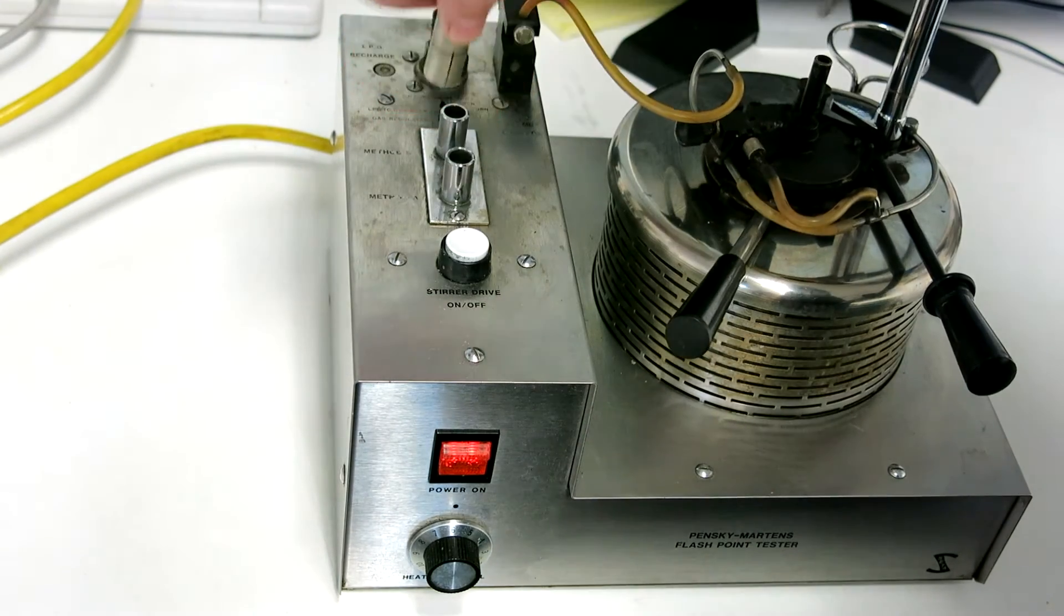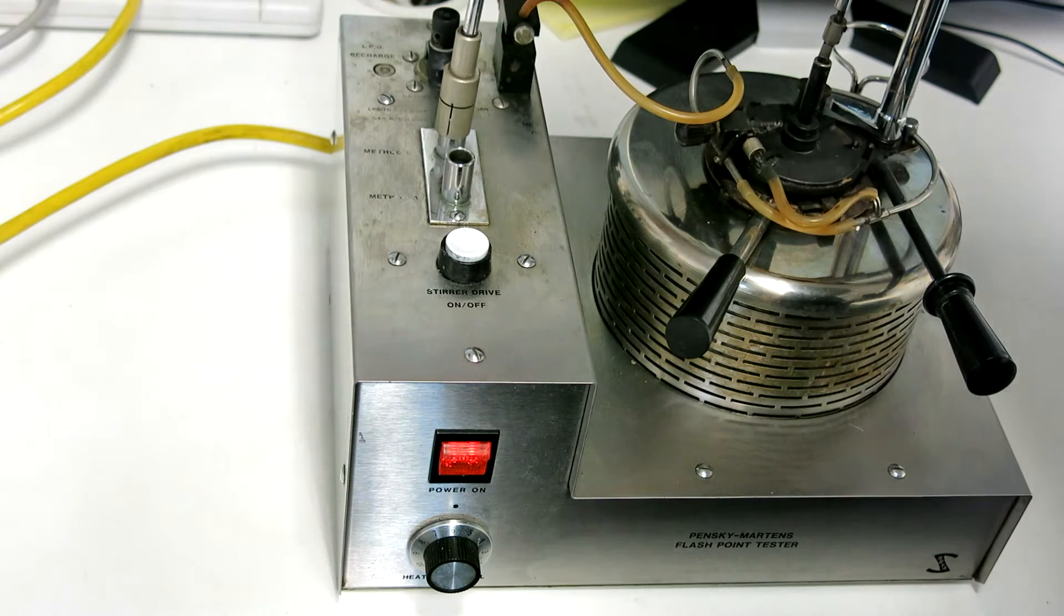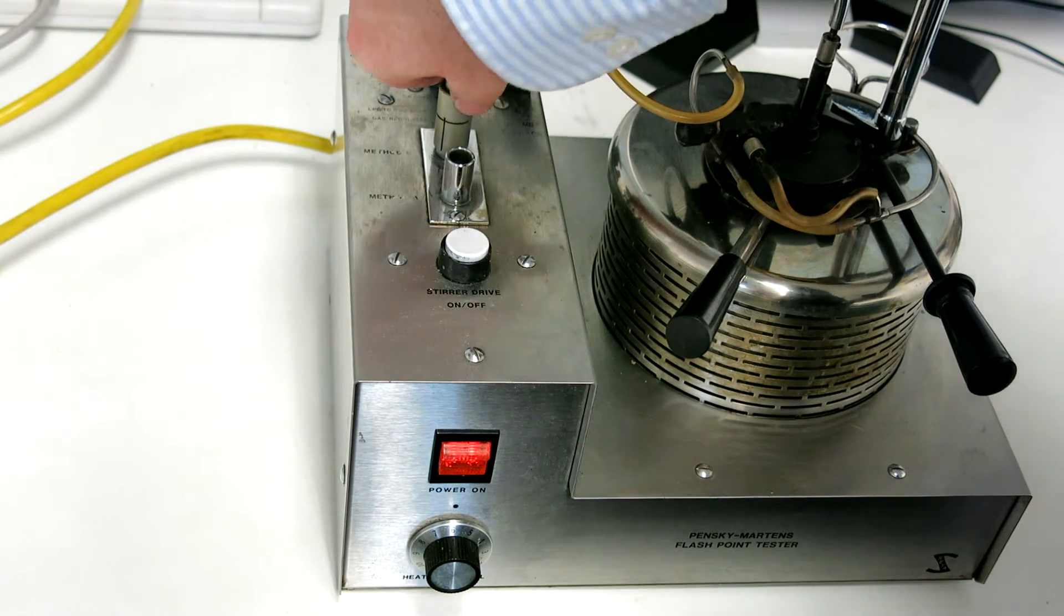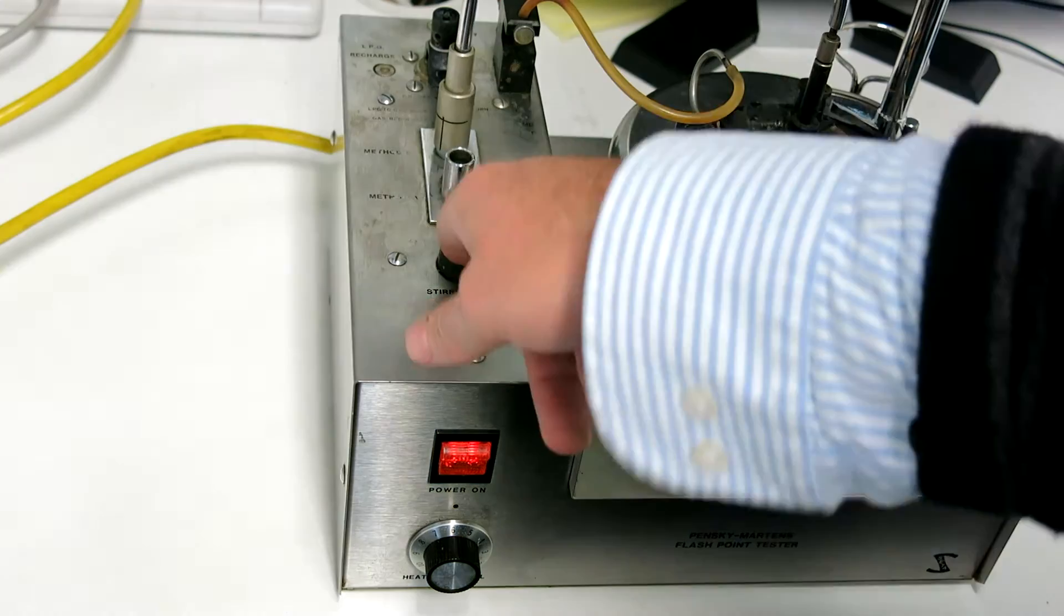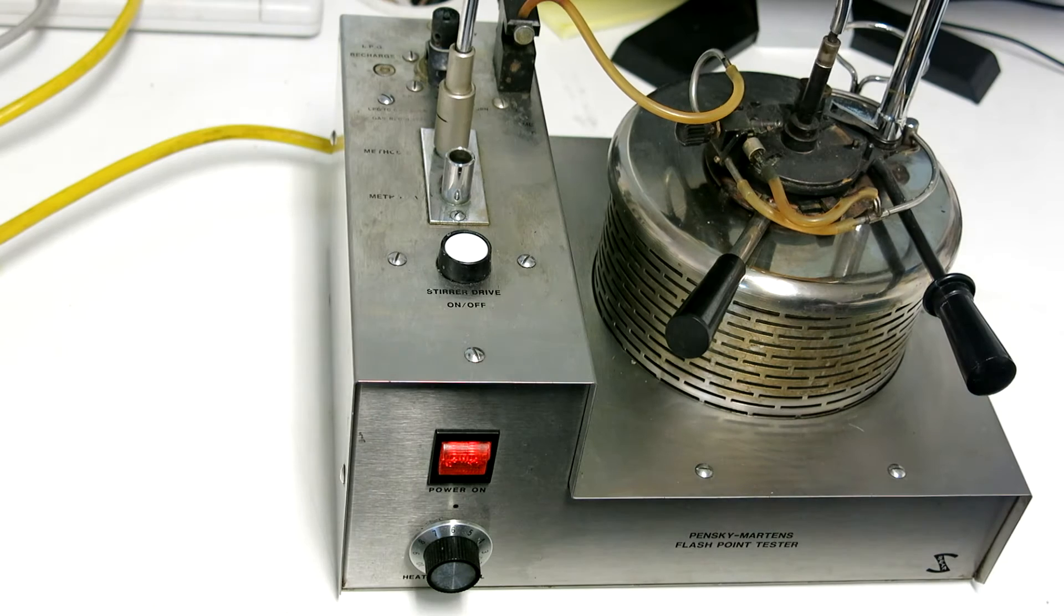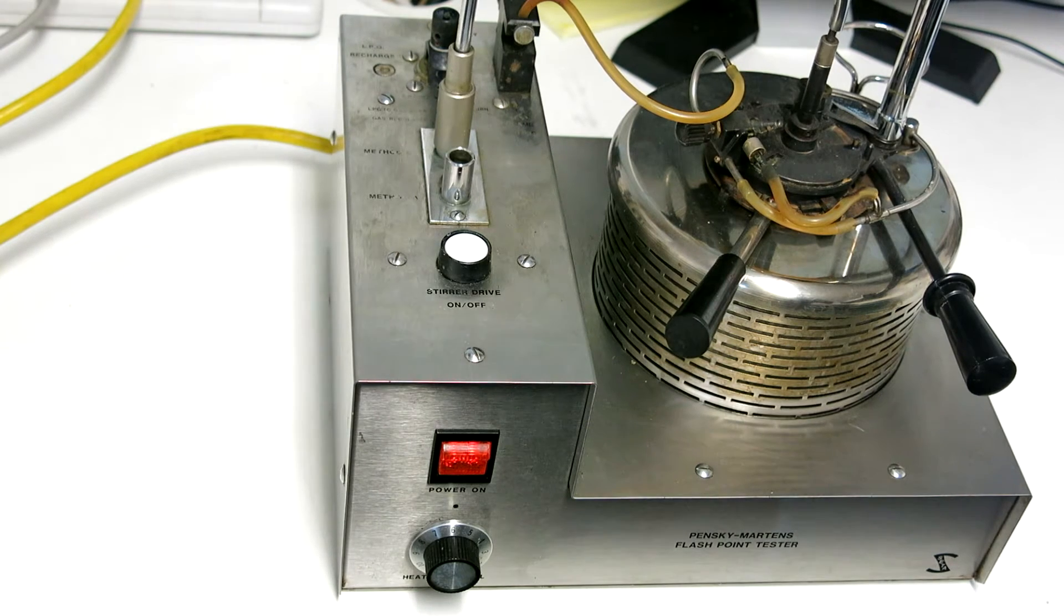The beauty of this is that you can change the method, you can put it onto different ones. So that's a very simple mechanism there. It fits in here, goes onto that one and that's obviously fast, so you've got a slow speed and a faster speed there.